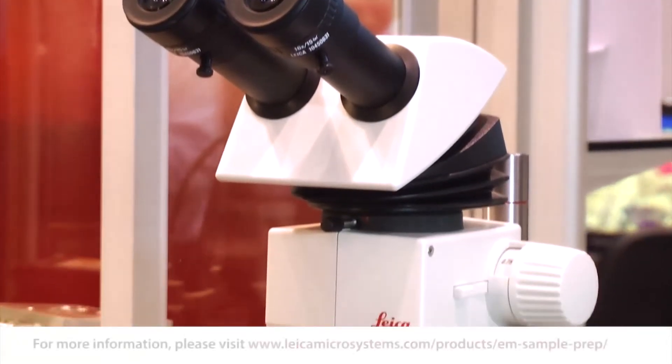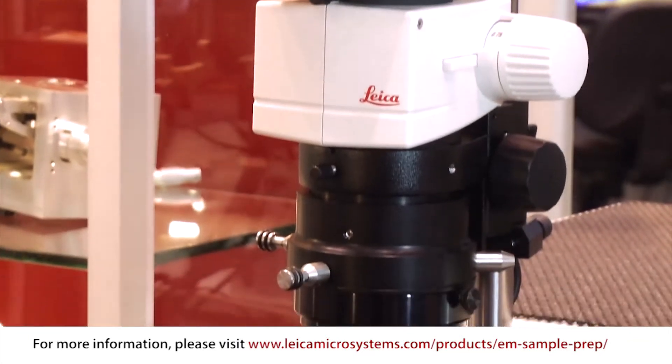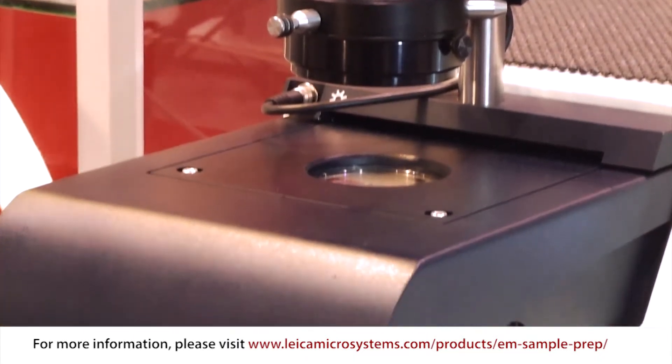This is our TIC3X ion milling system. For more information go to our website or contact your local Leica representative. Thank you very much.